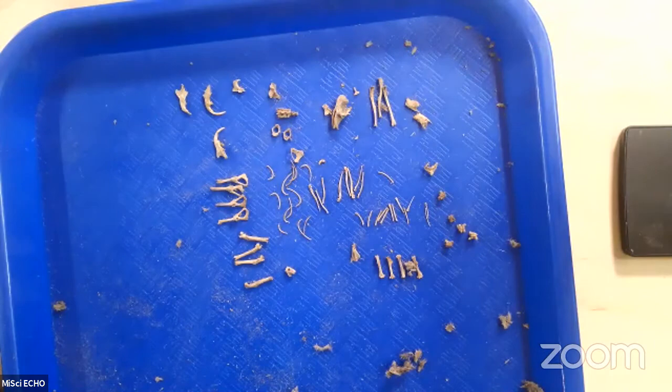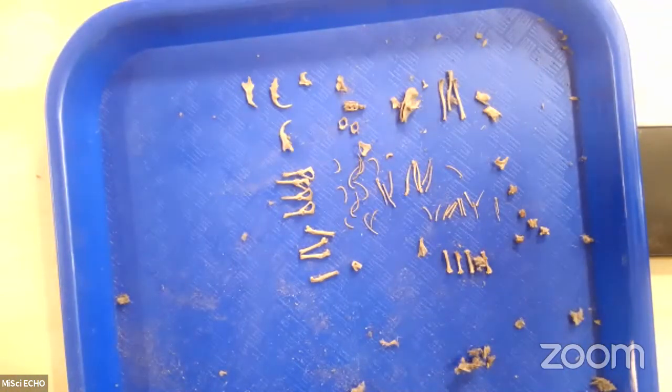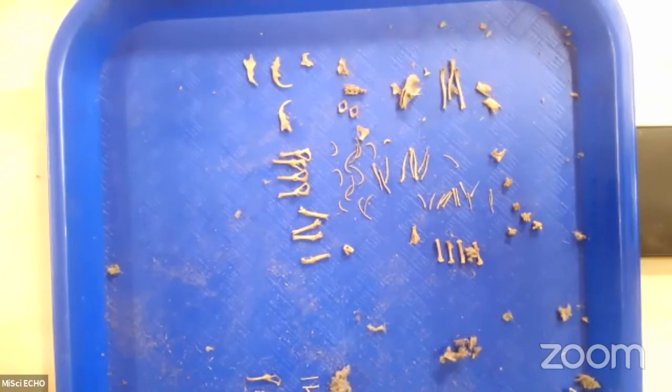So like we said, these owl pellets can teach us an amazing amount about the ecosystem and the diet of these owls, the different food webs that they're involved in, right? That they don't just eat one type of organism. So owl pellets are a great way to practice these kinds of skills, these types of identifications. And if you are interested in paleontology, the study of fossils, this is a great way to build those skills that you would need if you were to ever go out on a real dig for something like ancient fossils that are very, very delicate. This is a great way to start.